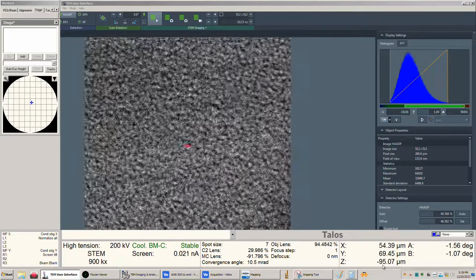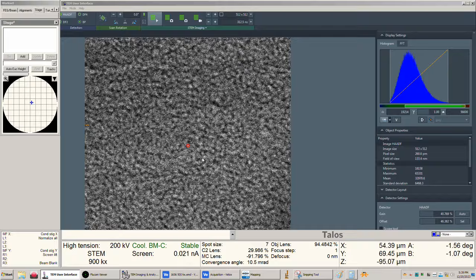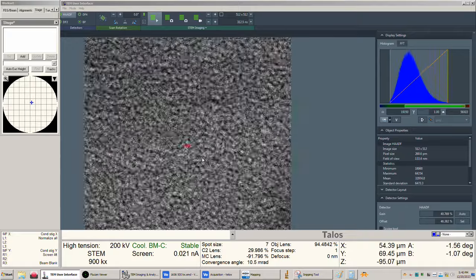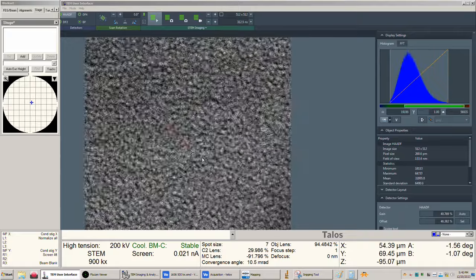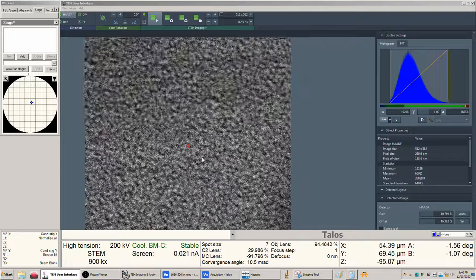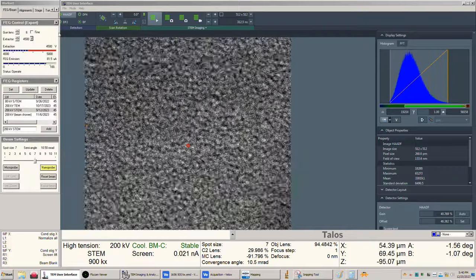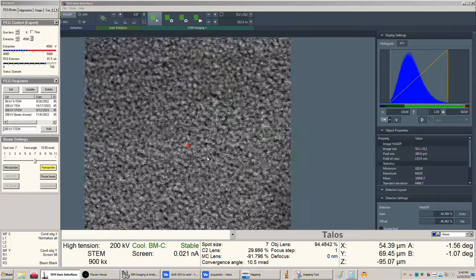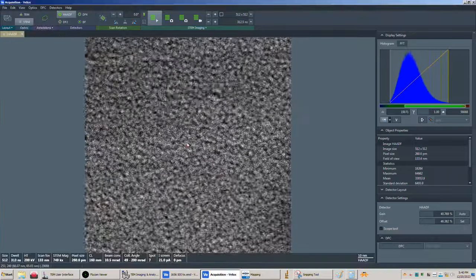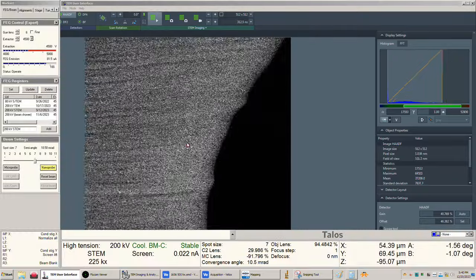This was 95.6 to 95, basically. So I only had to deviate about half of a micron, okay? And that's not unreasonable, okay? Again, your uncertainty when you set mechanical eucentric can be about half of a micron, potentially. And when you set the eucentric focus in nanoprobe versus microprobe, they are both done with respect to mechanical eucentric, but there's always a little hysteresis and whatnot, and there's always a little variation in setting eucentric. So the deviation was very small here, okay? It was only less than a micron, maybe only about half a micron, okay?